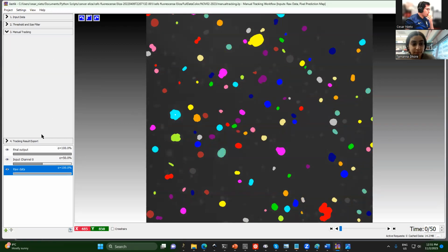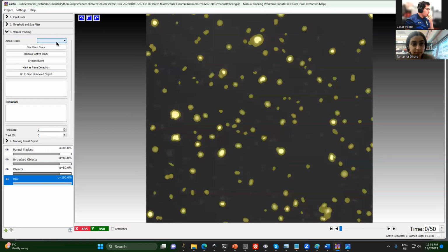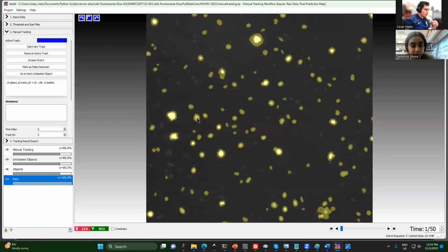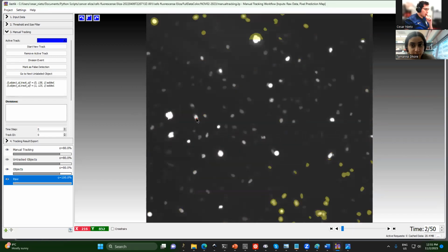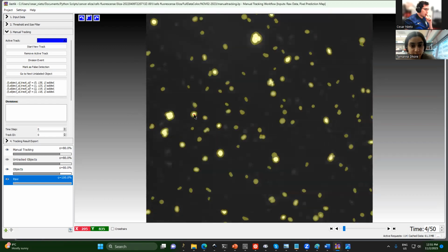Okay, manual tracking. So what I did was start a new track, and let's say this guy. In the next frame, now we are at frame 1, this guy. Frame 2, this guy.